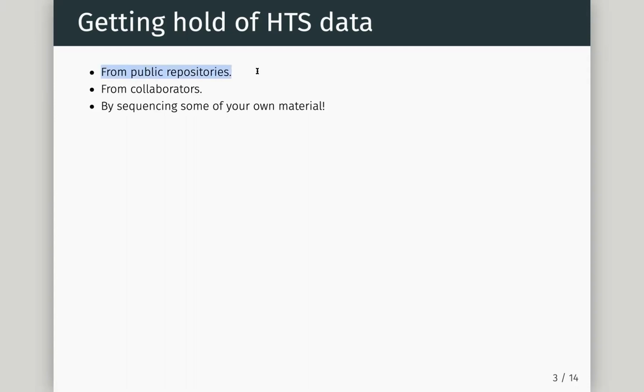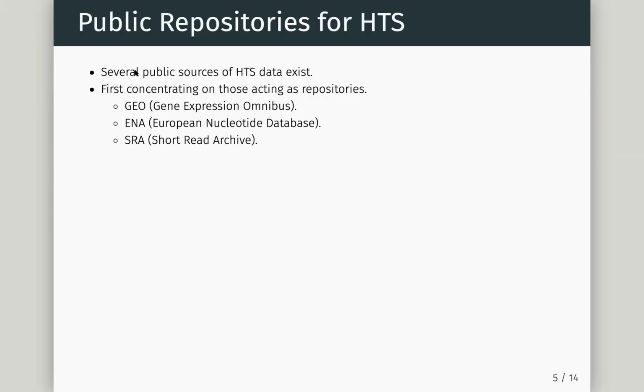Something we do a lot as a bioinformatics team, and I hope you will do a lot in your own analysis, is this: even if you have your own data, or if you don't, there's so much data available in public repositories. It's part of publishing in scientific journals, or at least biological scientific journals. You have to make your data available. And high throughput sequencing data, as we will see now, is very strict on this. So if someone's written a great publication and they've created some really interesting data that you want to get your hands on, you should find it in some of these public repositories. It's a requirement of the funding, and of most journals. There's always a journal which manages to escape putting their data in public repositories.